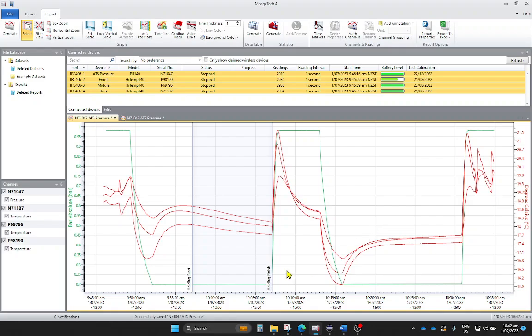And so we've now got those points labeled on our graph. When we print them out, it makes it a little bit clearer for the clients to see where we're getting our reference information from. So we've done the time slice, we've used the device statistics, and we've downloaded the data. So I think that's enough for this video. Thank you for your time.